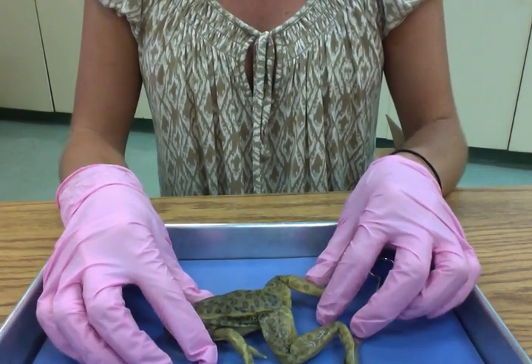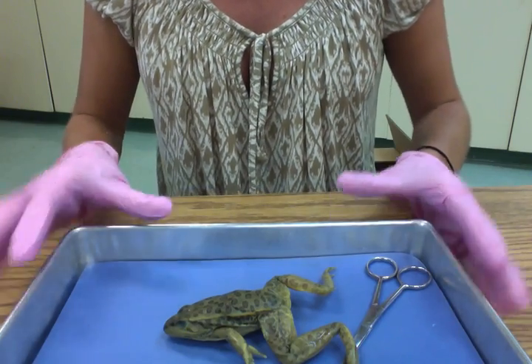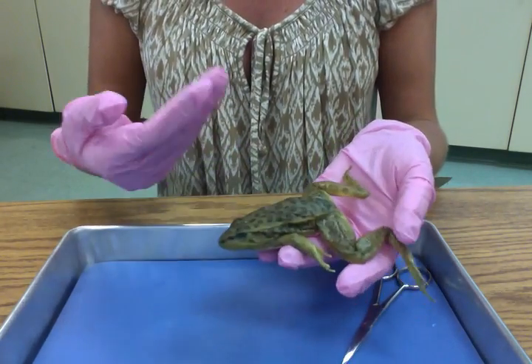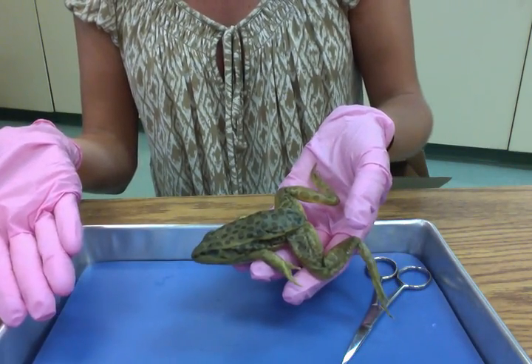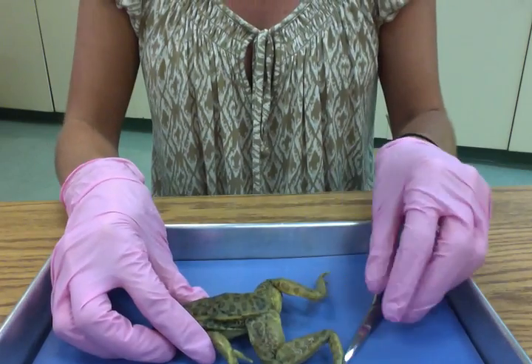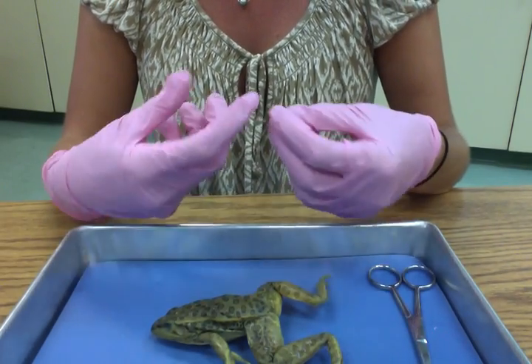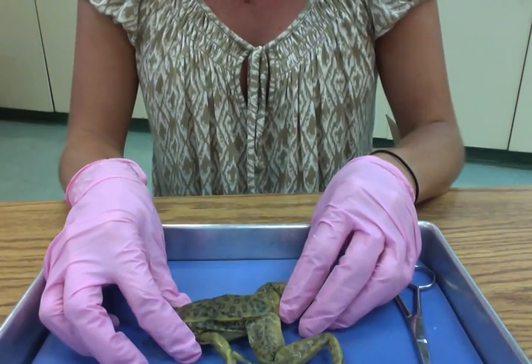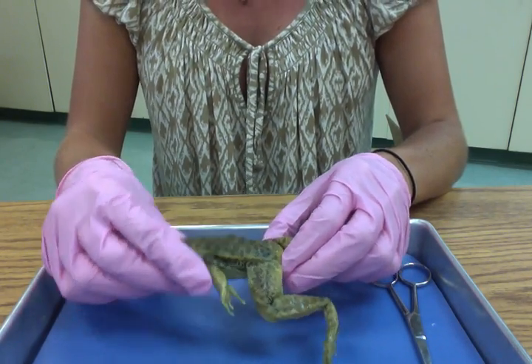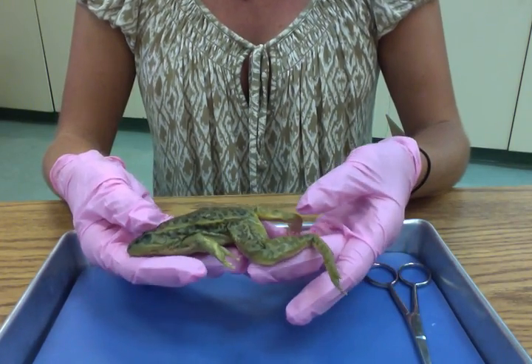Okay, I'm going to walk you girls through your dissection of a grass frog, also known as Rana pipiens. This is your specimen. We know that this specimen is in the domain, kingdom, and as we recently learned, it's in the class Amphibia. Amphibia, right? Amphi meaning double, so amphibian meaning double life, because we know that amphibians such as frogs and salamanders live a sort of double life with their early lifetime spent in the water and their adult lifetime spent on land.